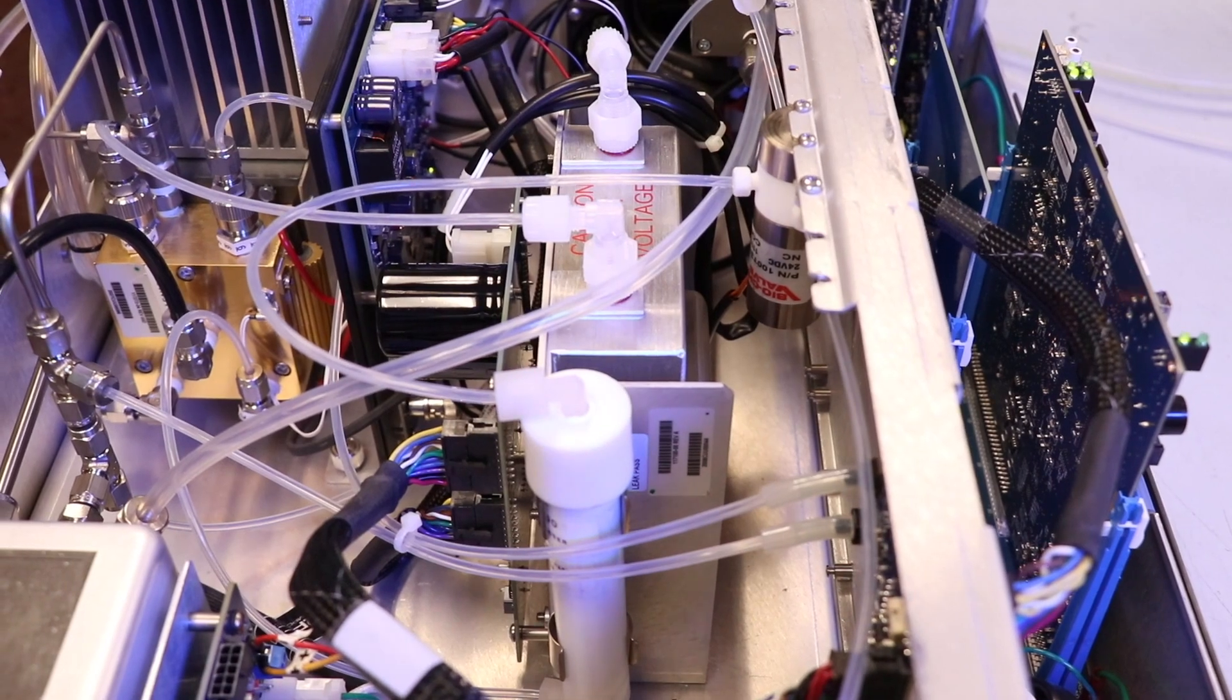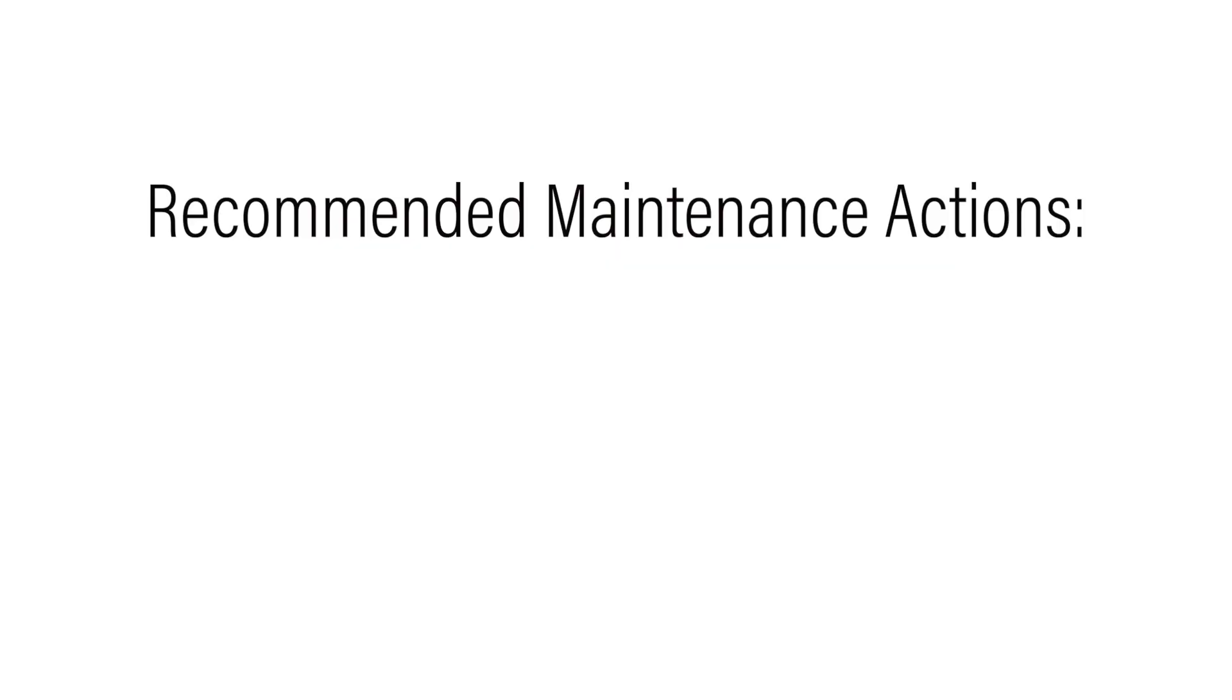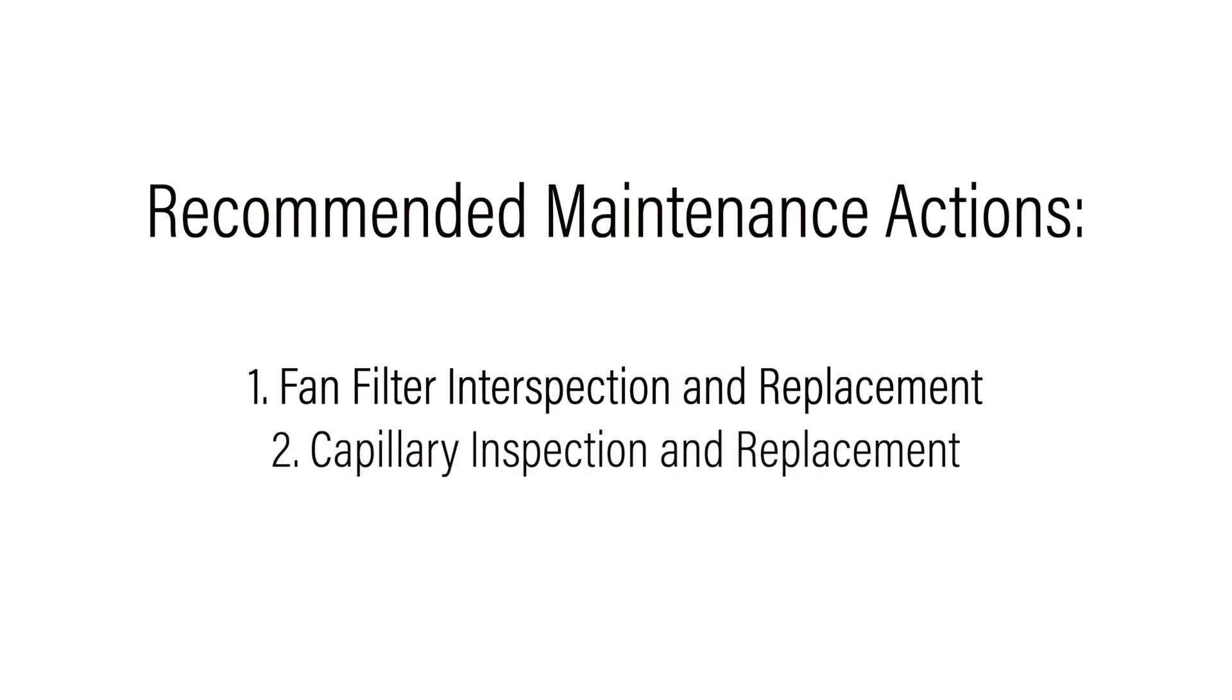Now that you have a basic understanding of the components in the layout, let's begin with some maintenance. First, the fan filter inspection and replacement. Then we'll move to the capillary inspection and replacement.